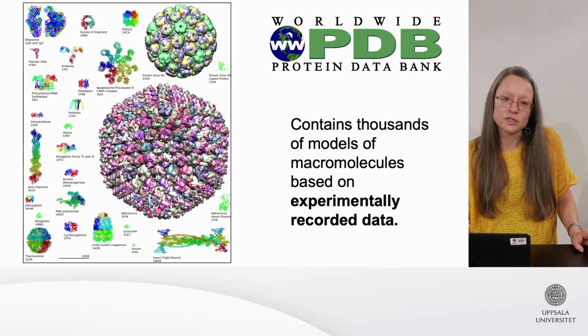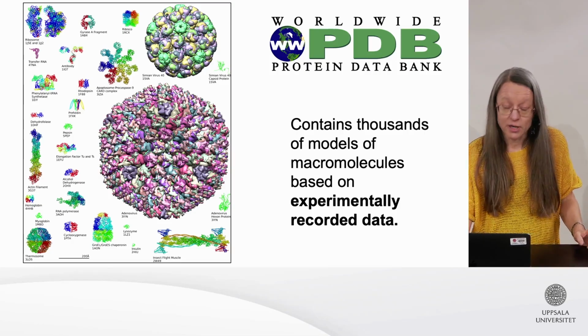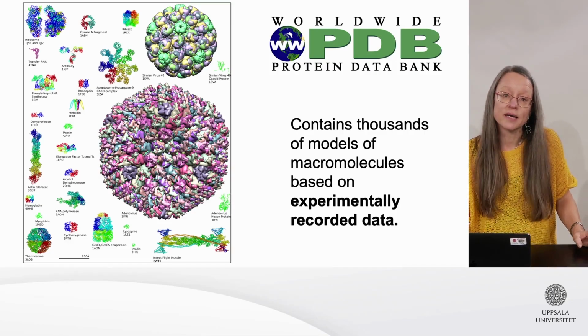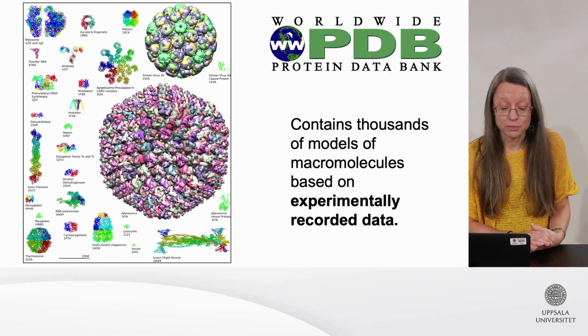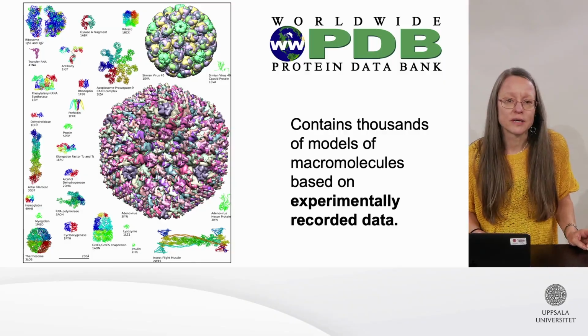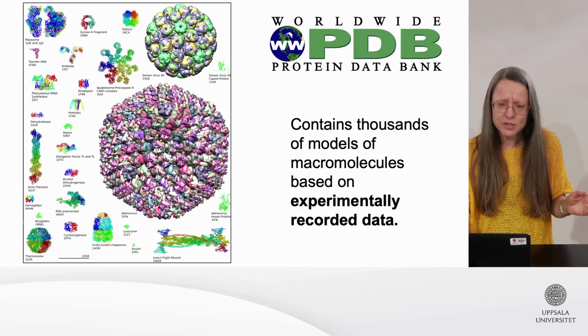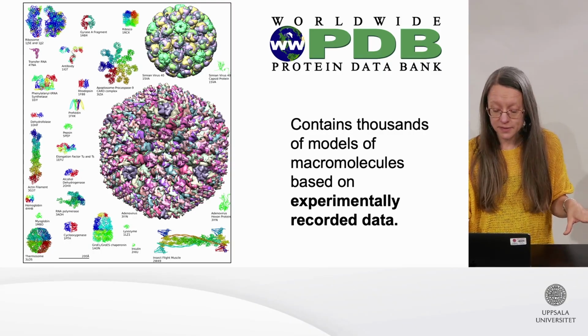So I can download a structure from there and the data, check to see that I agree with what has been described in the articles, and then I can use these structures in my drug design as well to get input for how molecules should bind, or just information about the structures that we're working on, the targets that we're working on, rather. So in the PDB, the structures there are based on experimentally recorded data.